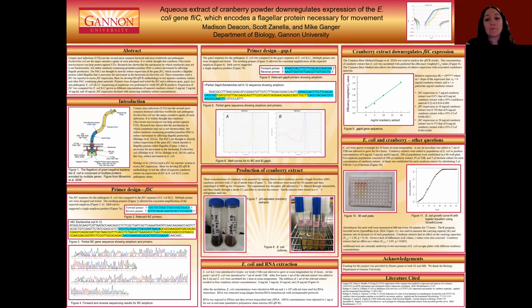With our GAP-A primers, they actually ended up working pretty well with our strain. We don't have them exactly where we want them to be, but we are planning on coming back to them at a later date. But for our qPCR reaction that we do, it does seem to work well as a reference gene and it doesn't change the expression.